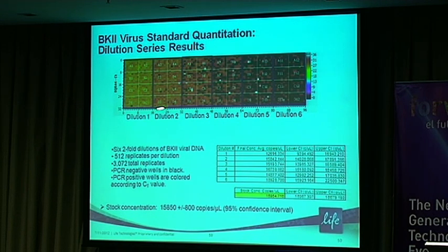What's happening in this case and over here is that we're just oversaturated. We distributed the sample across those subarrays, but we ended up with so many copies per well. There are not enough negatives. There's no way that we can go in with absolute certainty and say, okay, this was 1,000 copies versus 5 copies, right? Using a traditional endpoint digital PCR approach.